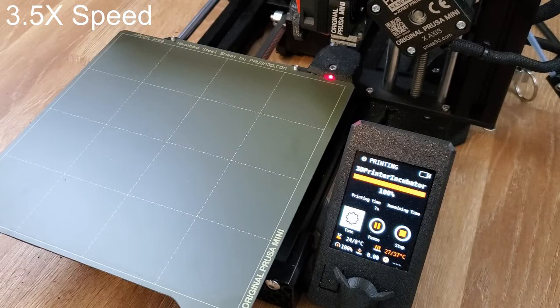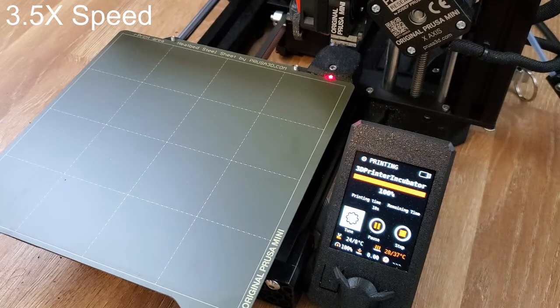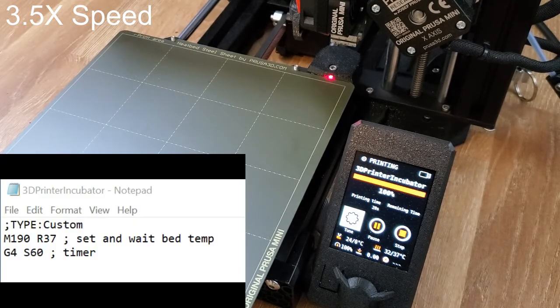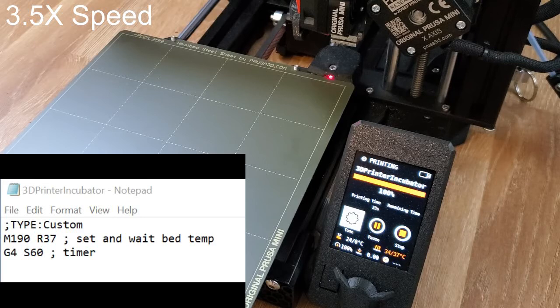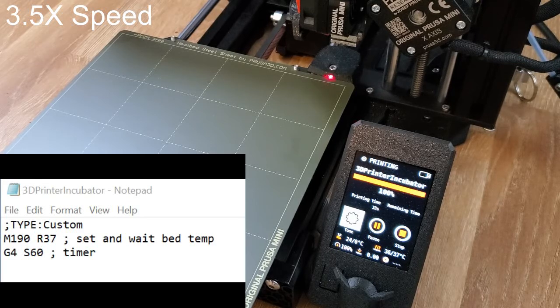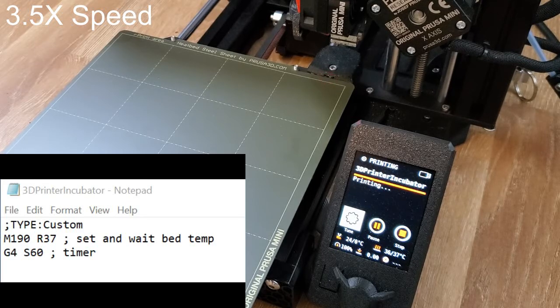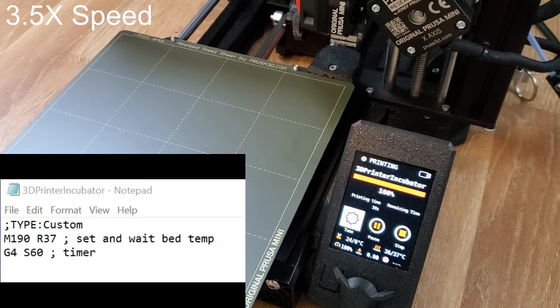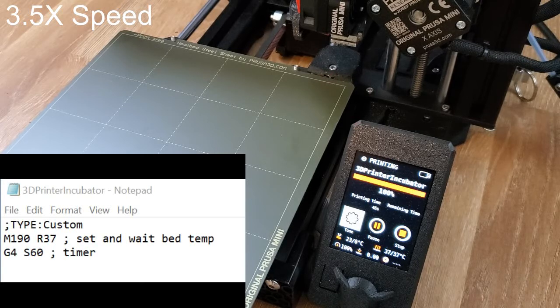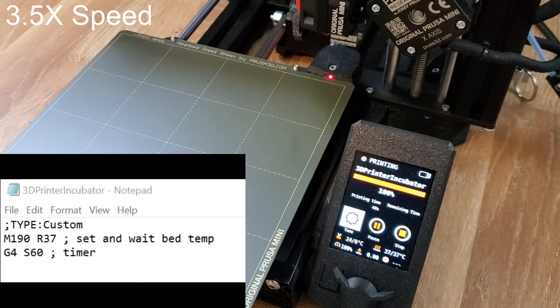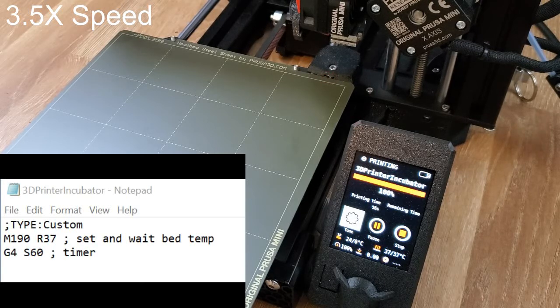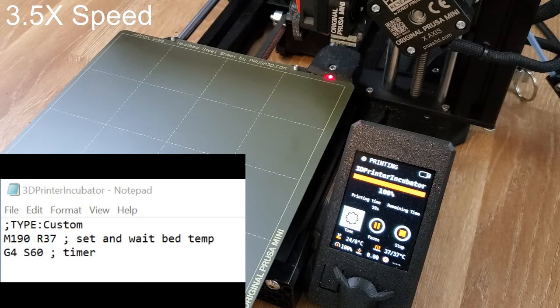I also turned the Prusa Mini Plus into an incubator with just two lines of code. M190 R37, which sets and waits for the bed temperature to reach 37C. Then G4 S60, which is a pause command set for 60 seconds.